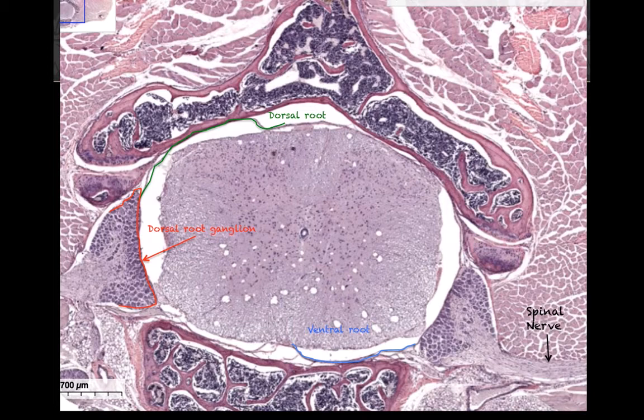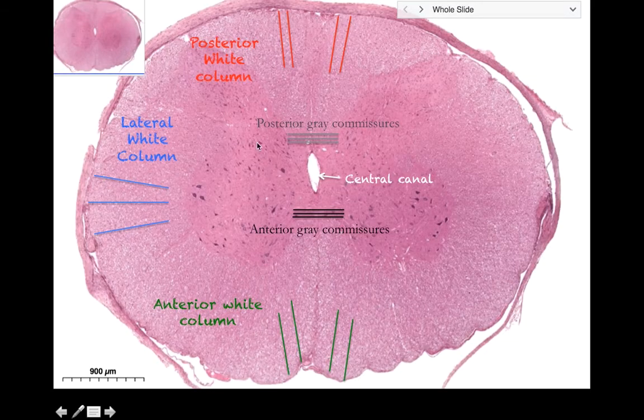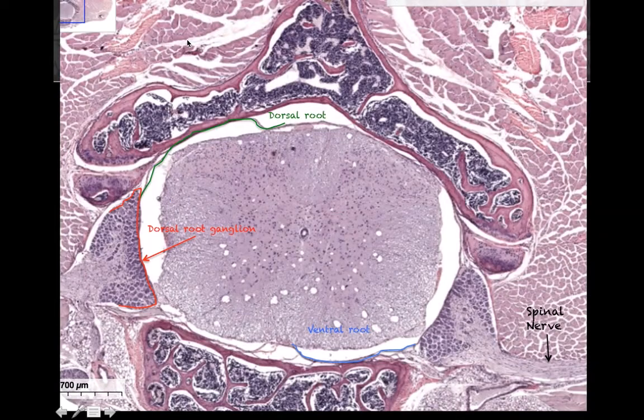The dendrites collect information, they send it to this ganglion for integration, they send it down its axon to synapse with the gray matter. I wish you could see the gray matter better in this one, but it synapses with the gray matter right here, so you can see it joins. This is the gray matter, and this is where the dorsal root would join. That's where they synapse. So the axons of the sensory neurons synapse with the cell bodies and dendrites of the ones that collect the sensory information. Doesn't that make sense that the sensory information is up top where the dorsal root comes off?